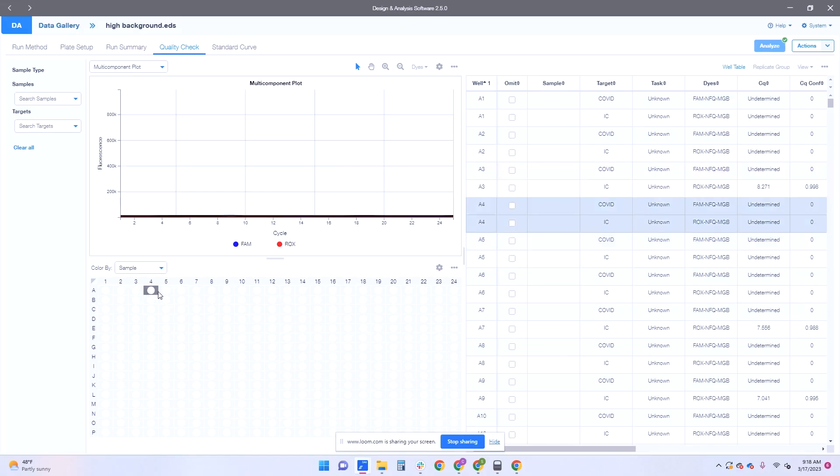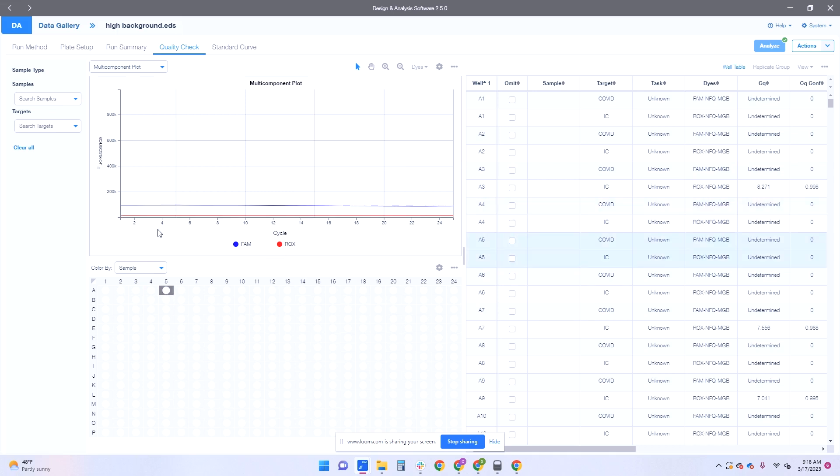So you can see like here you have low fluorescence but here you notice for another blank you have high fluorescence. This might be a target for you to go and clean. So let me show you how to clean.